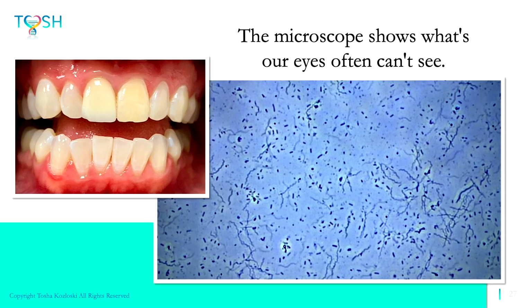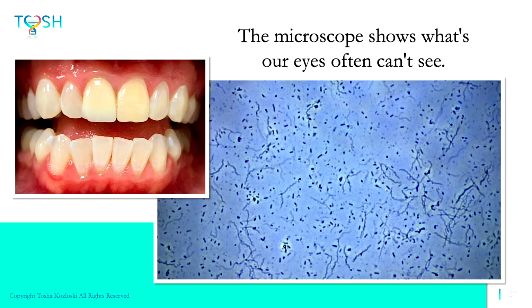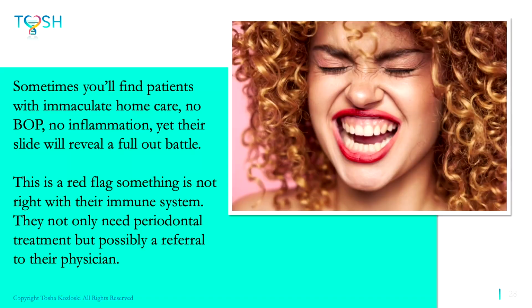I've had plenty of patients that look absolutely fabulous, all to find out that their mouth is swimming with infection. Sometimes you'll take a slide on patients that look absolutely fabulous, and their microscope slide is like an all-out battle going on there. And if we can treat and really identify these infections in those early stages before any signs and symptoms, we're being far more proactive than reactive.